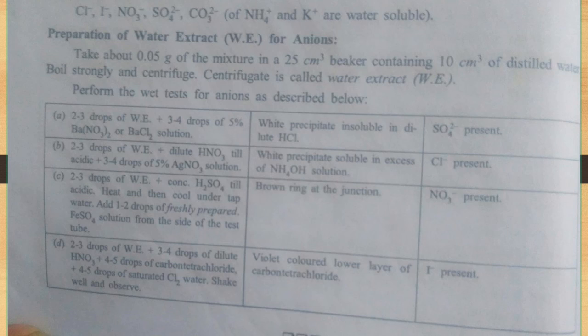It is obvious because it is present in the mixture. But do not write sulfate present as the impurity anion. So if in that case you get sulfate ion, in the bracket you will write 'from major salt'. Okay, your impurity anion is different from sulfate.